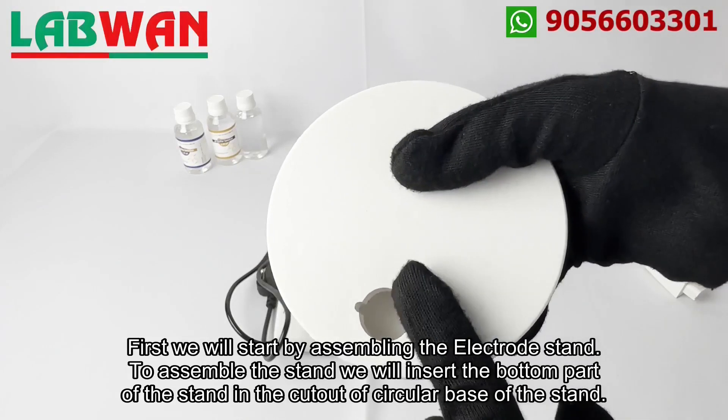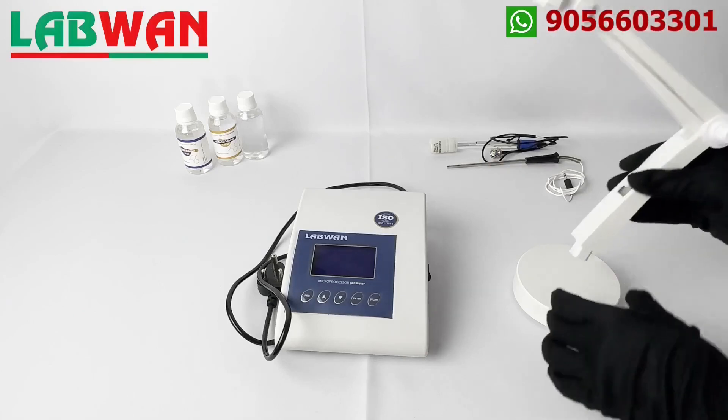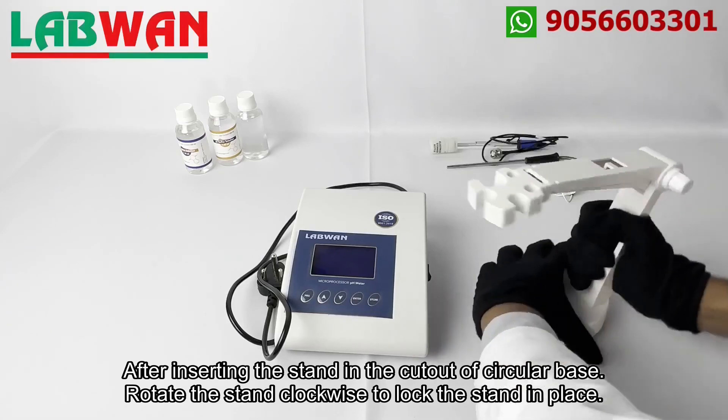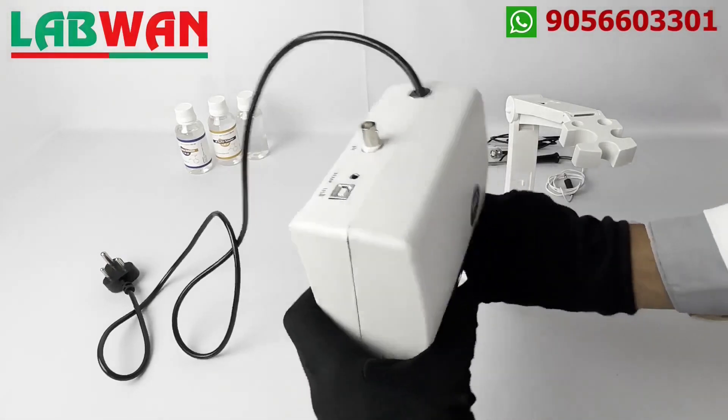First we will start by assembling the electrode stand. To assemble the stand we will insert the bottom part of the stand in the cut-out of the circular base. After inserting the stand in the cut-out of the circular base, rotate the stand clockwise to lock the stand in place.